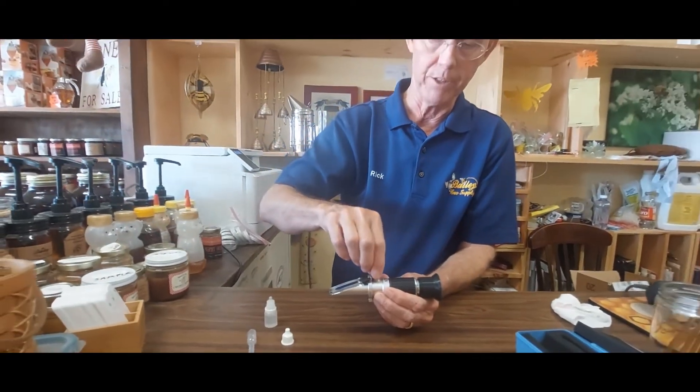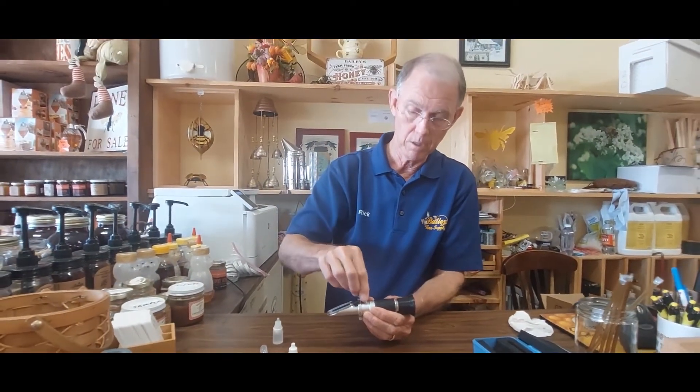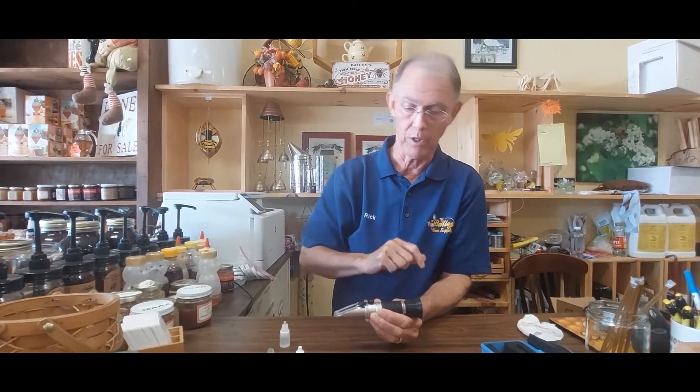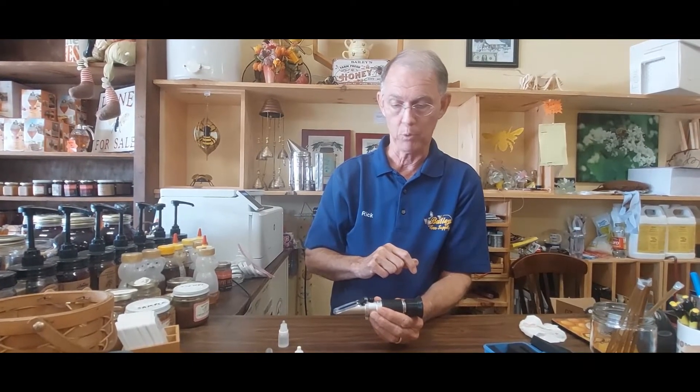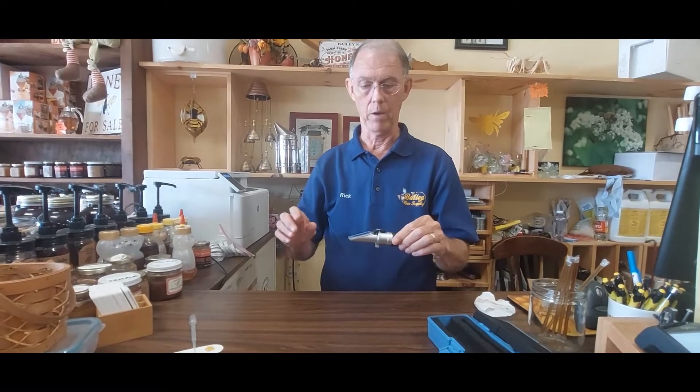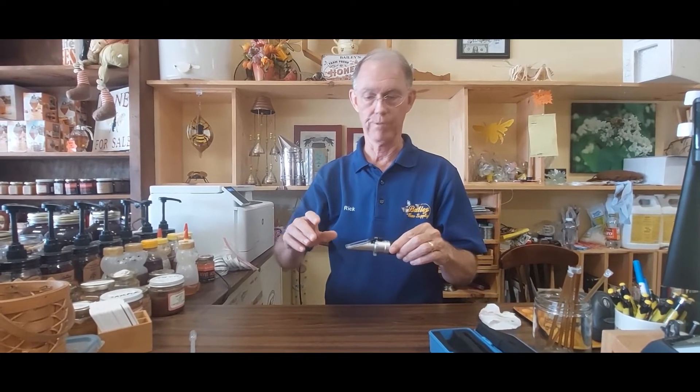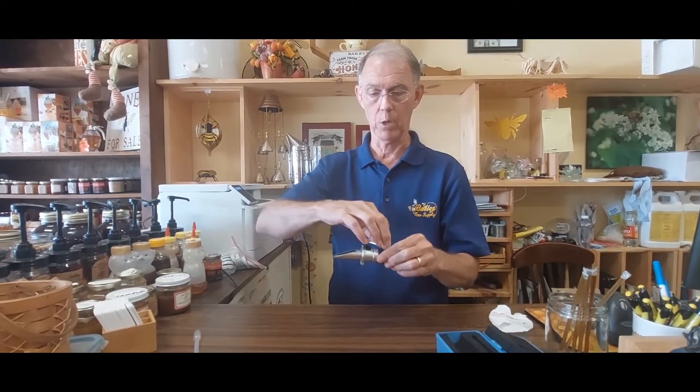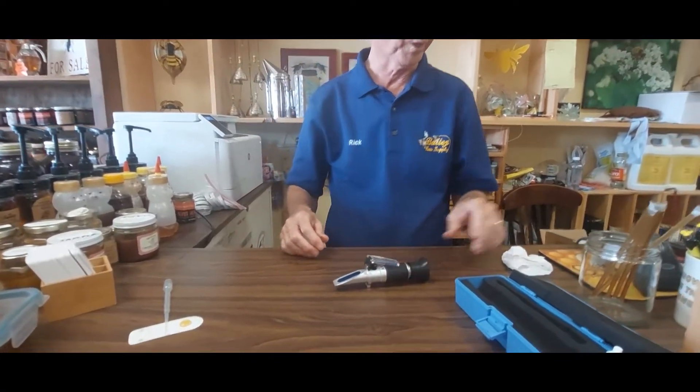After you have it calibrated, just place this little cap back over so it doesn't get tampered with or changed. Now I will show you, this still has the calibration fluid on it. So I'm just going to open it up and clean this off before we do a sample.